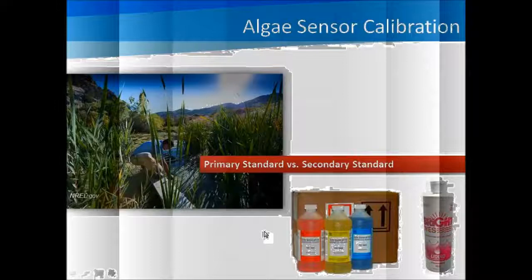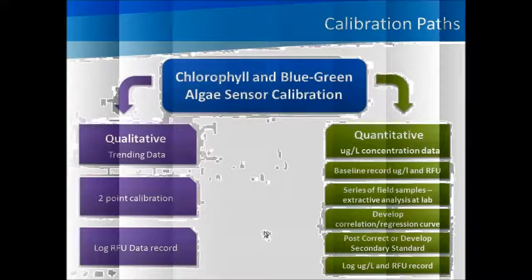And even though reagents exist for calibrating lab fluorometers and spectrophotometers, these are all extracted pure chlorophyll A reagents where the cell walls are not intact, whereas with in situ, we're taking a measurement that excites the whole cell. So there are two approaches to calibration.